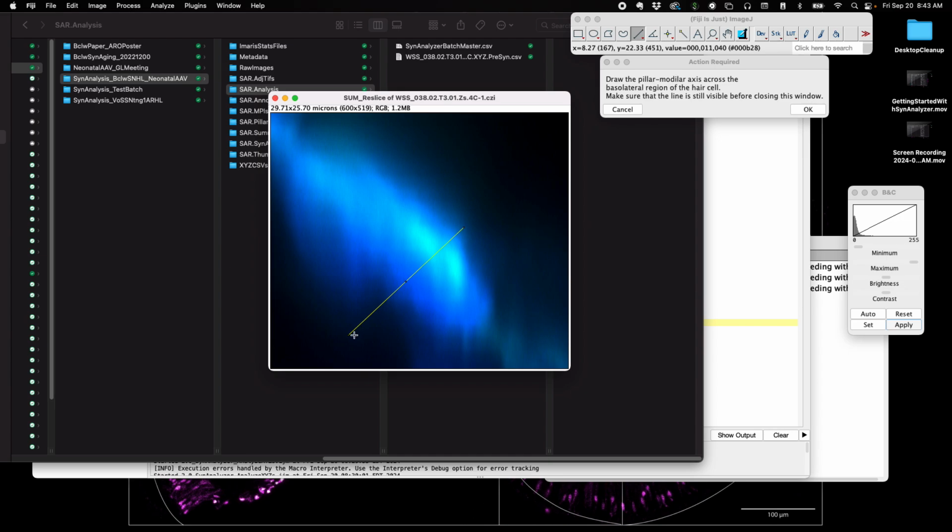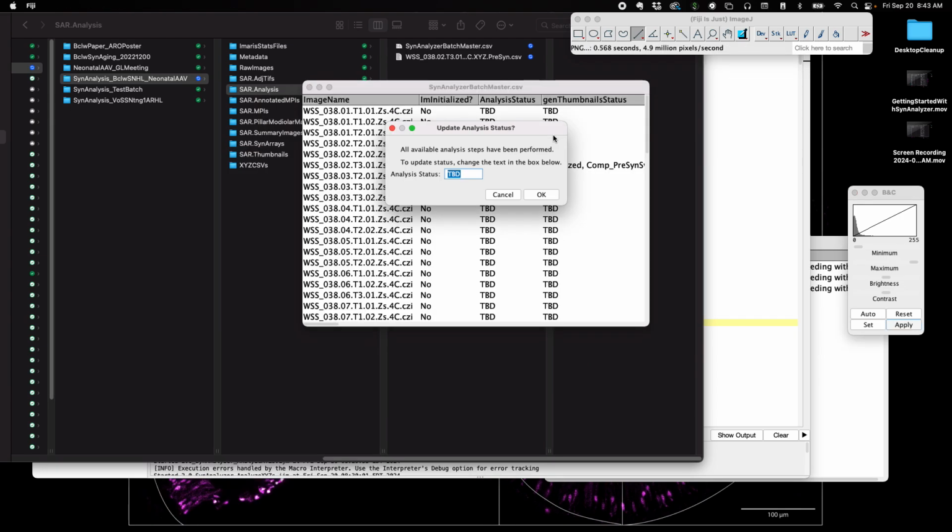So hopefully that makes more sense after I click OK, but I'm just going to adjust it a little bit to roughly what I think it should look like here. And then I'm going to click OK. And then boom. Sorry, everything disappears really fast because I want to close images to keep memory available. But we can go back and review it in a second.